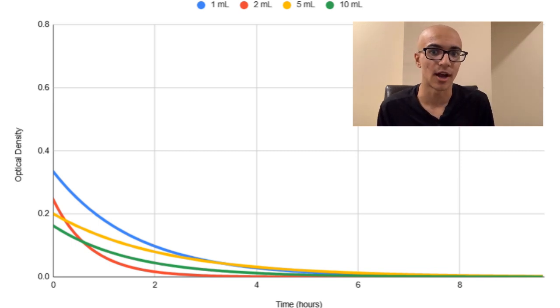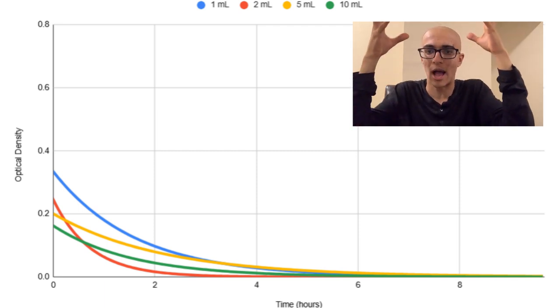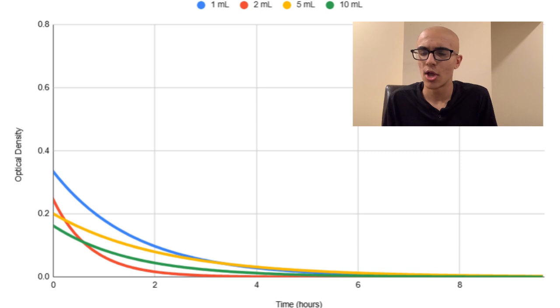That's the optical density of water. Essentially, if you remove all the algae out of water using the modified clay, you're just left with clear water, which is indicated by that optical density of 0.01. So when I reached that point, I stopped the experiment and I considered everything completely flocculated.